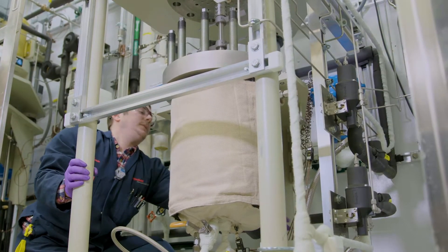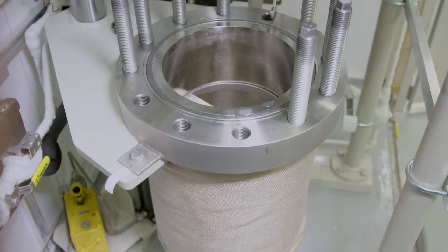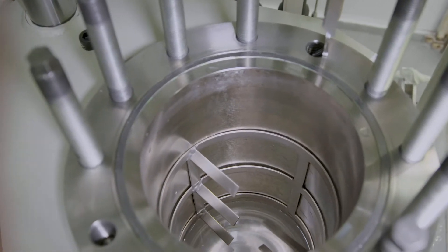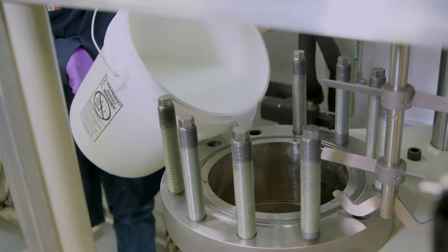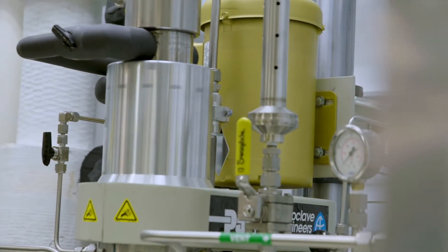Creating a catalyst begins with creating active materials through hydrothermal synthesis. This process combines several raw materials into a slurry that is poured into a reactor. The reactor applies heat and agitates the material, which results in the formation of catalytic crystals.